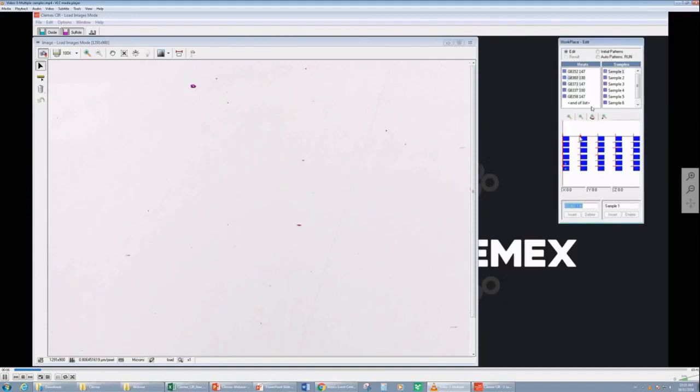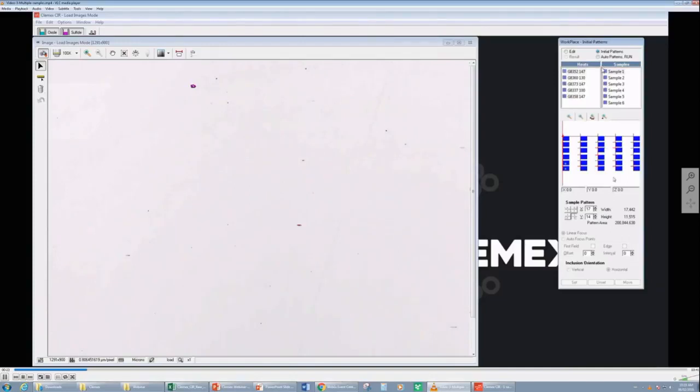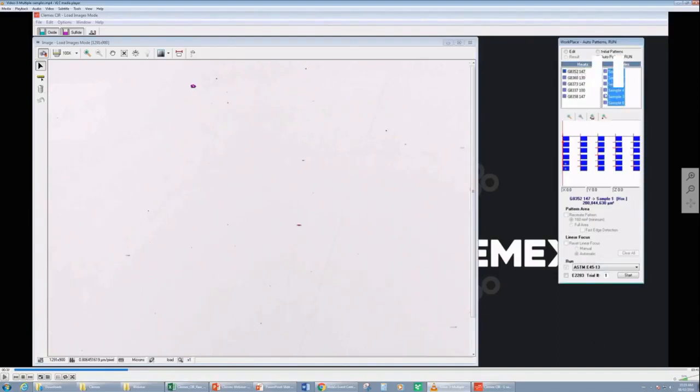So what we're doing now is showing you the location of each heat. As we click, it changes. The name also changes on the bottom. So we click on one, the sample is here, and we're going to be analyzing only one heat in this case. So we chose one heat, and we'll be analyzing all those samples. We're not obligated to analyze all of our patterns. We can choose only one heat and a few of the samples from that heat if we choose to.